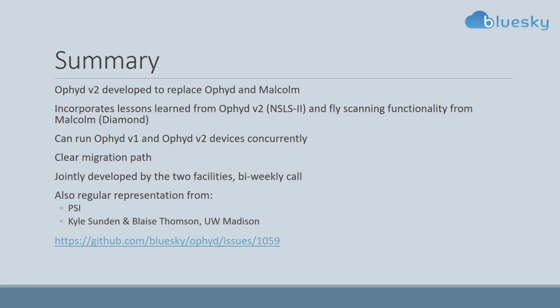I think what we plan to do is provide a solution for fly scanning that is not there at the moment, and start rolling it out across Diamond and NSLS-II. And that's pretty much it.